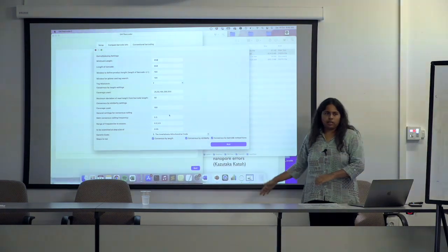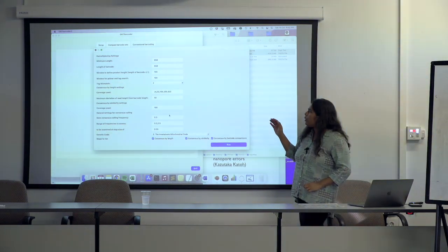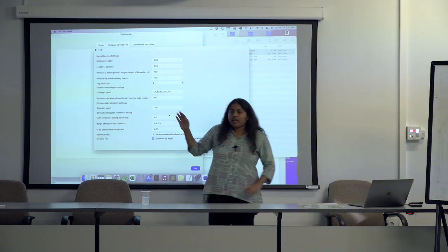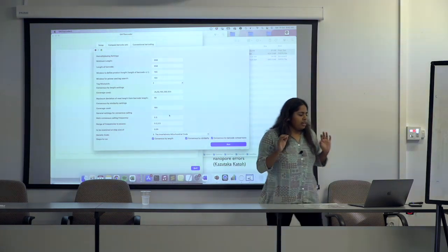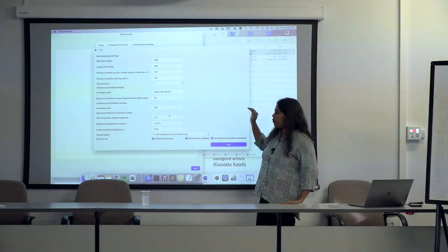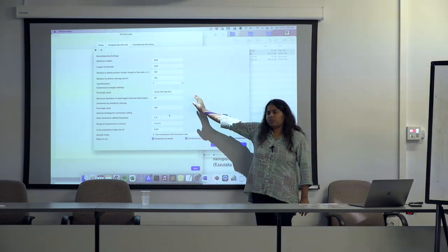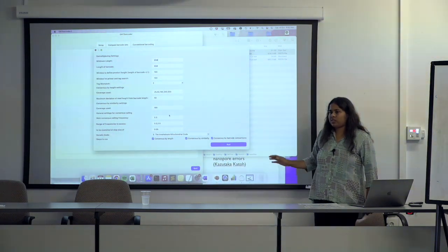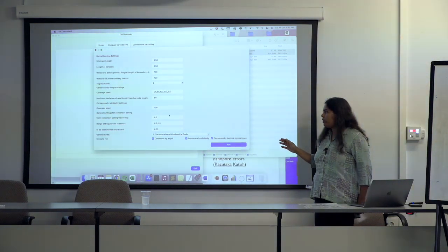If anything, we would see a decline. We would always see that something like 50 to 500x gave really good quality barcodes, but this was at the stage of 9.4. With 10.3 and 10.4 this is much less. I think even at 5x you are getting decent barcodes with 10.4.